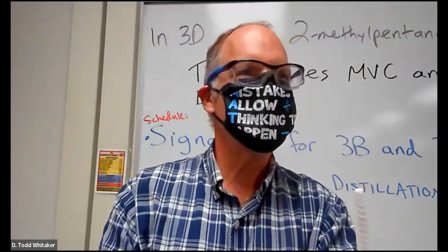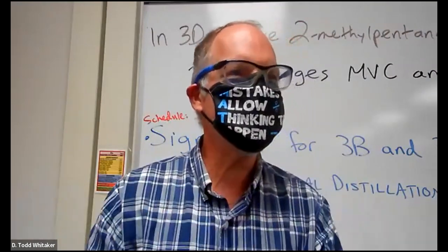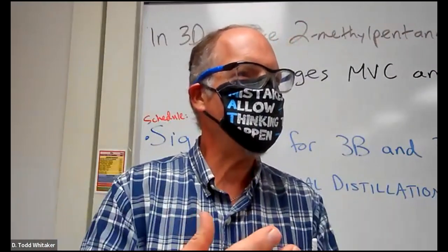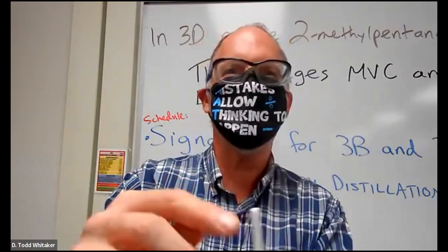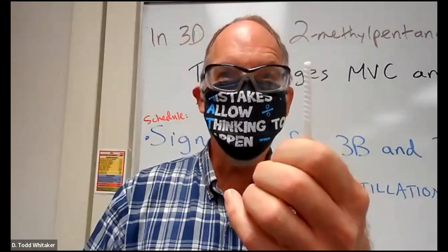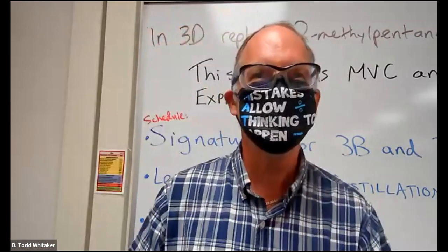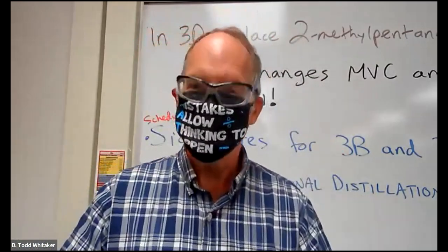Downward. So you're actually returning liquid to a lower place so that it can get heated up and evaporated again, maybe even condense where it condensed the first time, but it's a new cycle, isn't it? In the same volume, because you returned the liquid to a lower place. Nice. So I'm going to write that on the answer.